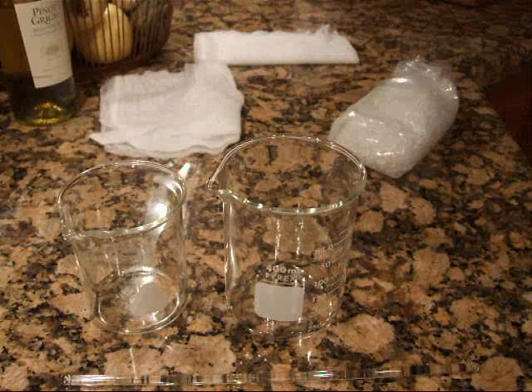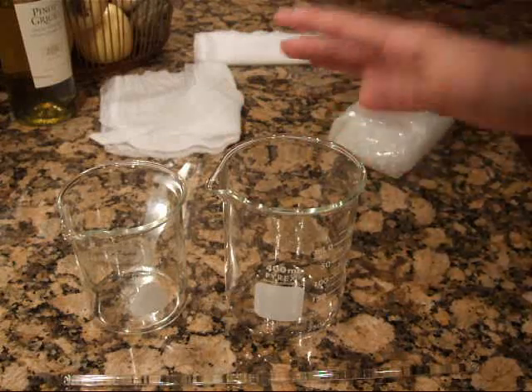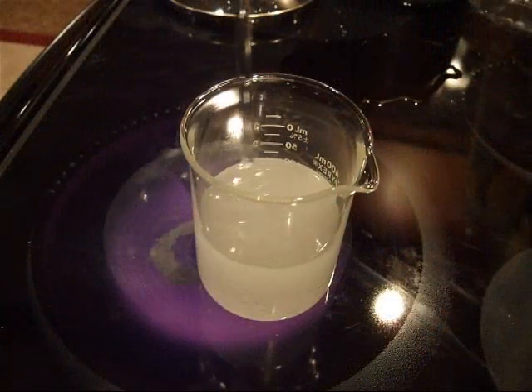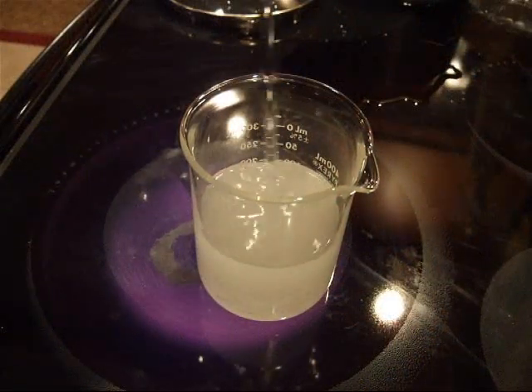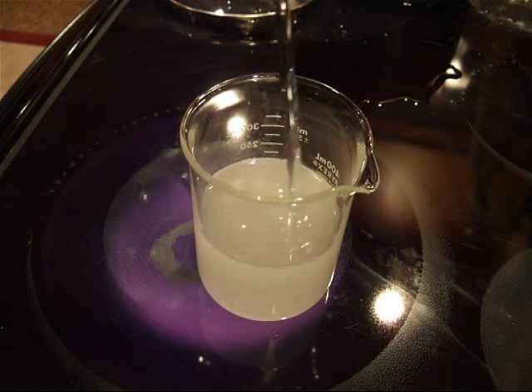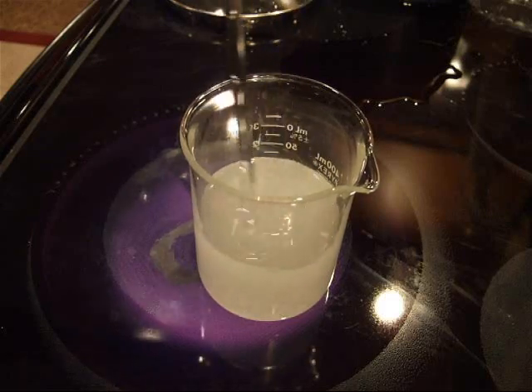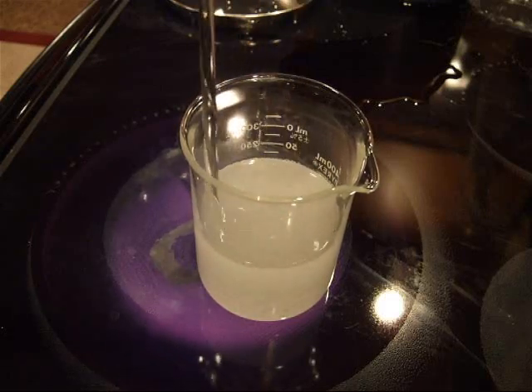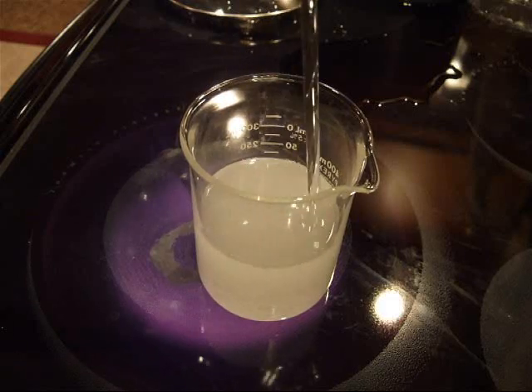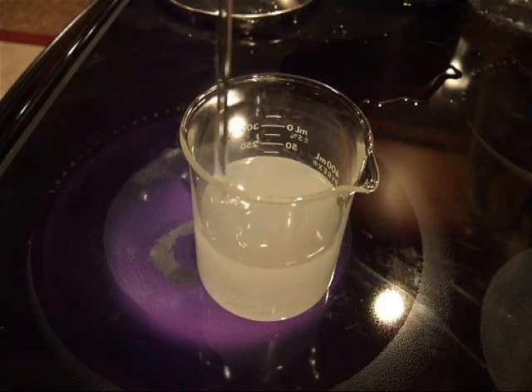What you have is a hot solution and you let it cool down, which is exactly what happens in nature when we make crystals. Oh, I see something yellow in there — I don't know what that is. I'm not grossed out, I'm just worried because nothing is supposed to be introduced. I think it was in the hypo solution already. You don't want anything to contaminate the solution.